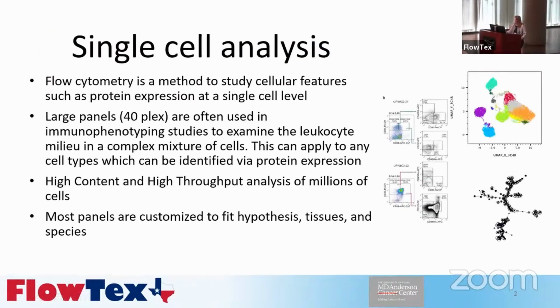Okay, there we go. So just a title slide, we know what flow cytometry is. We're looking at a single cell level. We want to be able to use large panels to get big data out of single cells. In this talk, I'm going to mostly talk about immunophenotyping or antibody-based analysis of largely immune cells. However, as Jake told us, flow cytometry can include all kinds of different things. And these panel design principles can be applied to any sort of assay that you're running. My objective here is really to tell you about how to think about panel design and the process that I would go through to design a panel, all the way from a simple panel to something more complicated. And I'm not going to work you through how to do this in any kind of software, but more how to think about it.